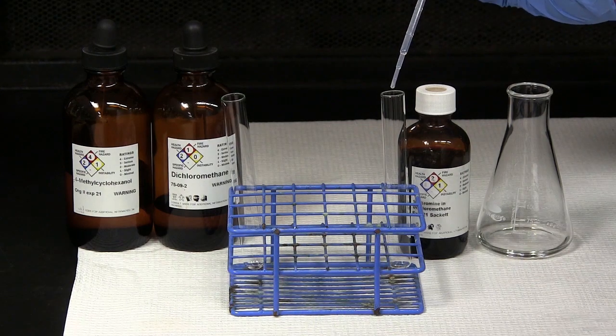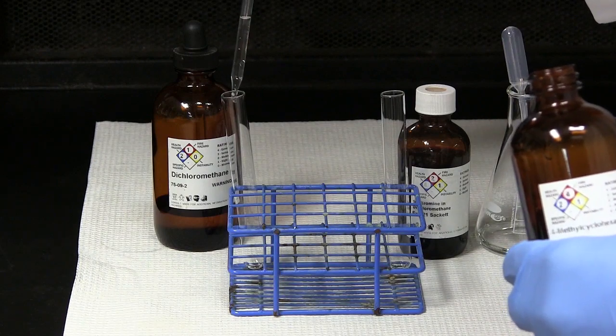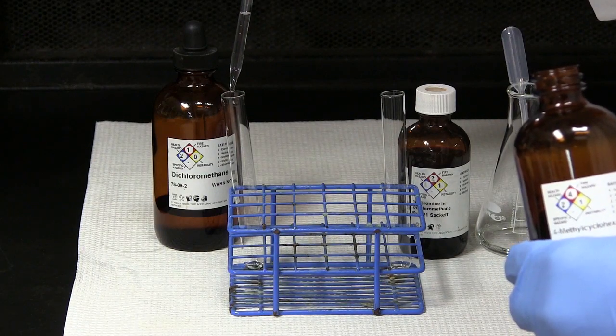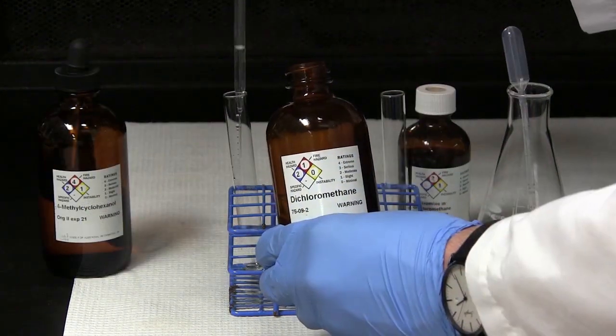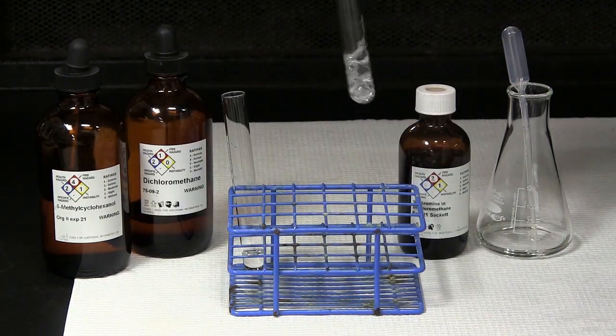Obtain two test tubes. Add about 5 drops of the product to one test tube and a similar amount of 4-methyl cyclohexanol to another test tube. Add 1 ml of dichloromethane to each test tube and gently shake to mix.